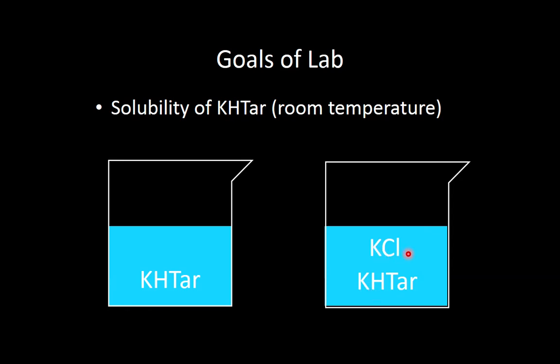So this pretty much summarizes what we're going to do in lab. When we get in the lab, we're going to talk about how to set everything up. So that's going to be the first thing we talk about when we get into lab.